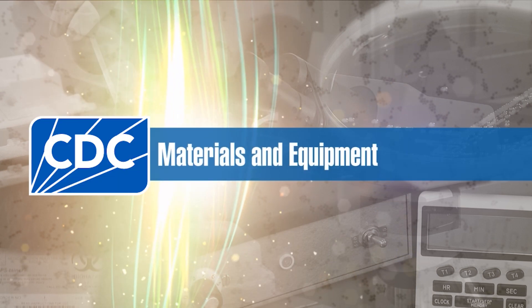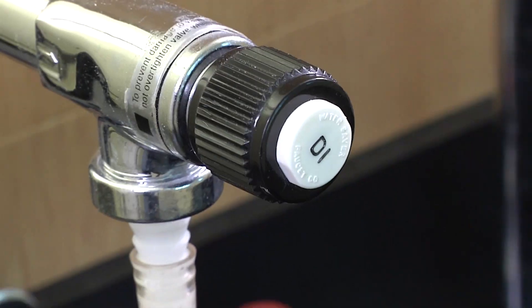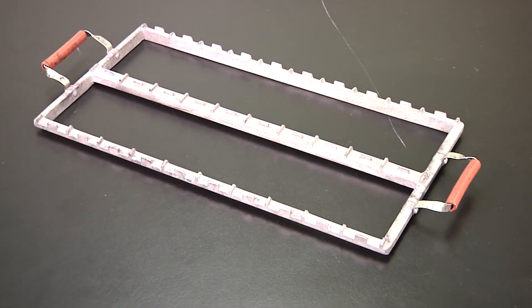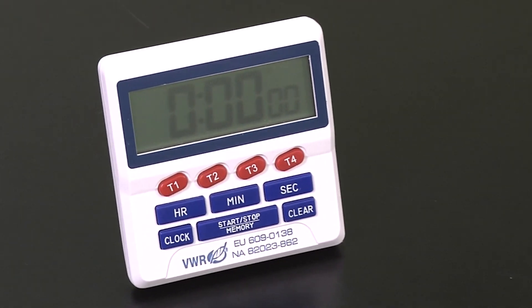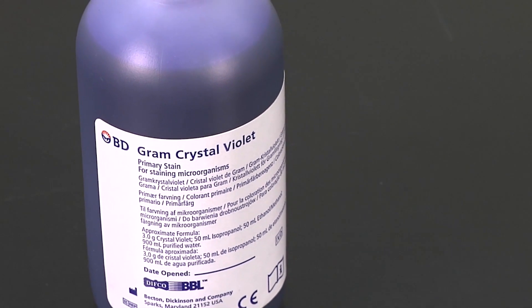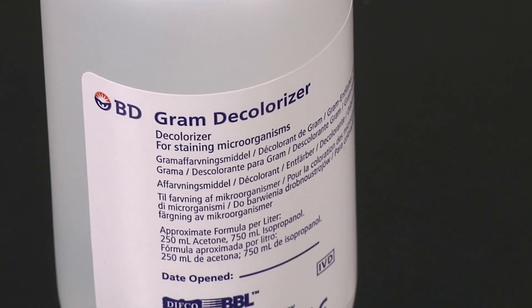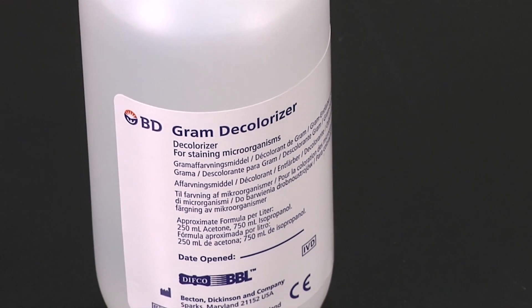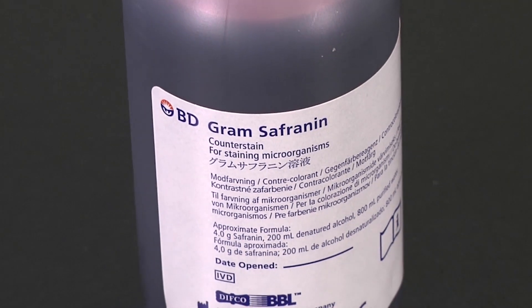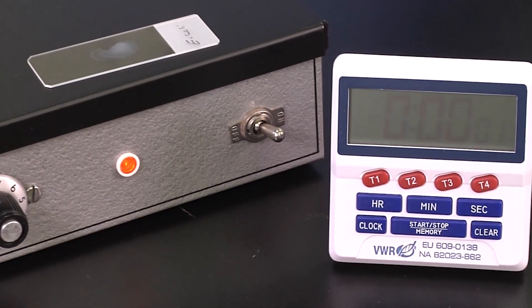For this procedure, you will need the following personal protective equipment, a clean water source, a slide rack, and a timer. For reagents, you will need crystal violet, Gram's iodine, a decolorizer which is usually a 50-50 acetone/alcohol mixture, and safranine or carbolfuchsin. Your sample should be a thin, heat-fixed bacterial smear.